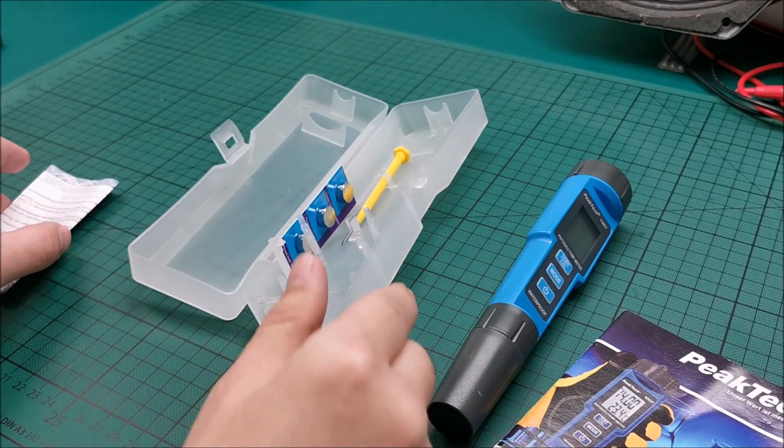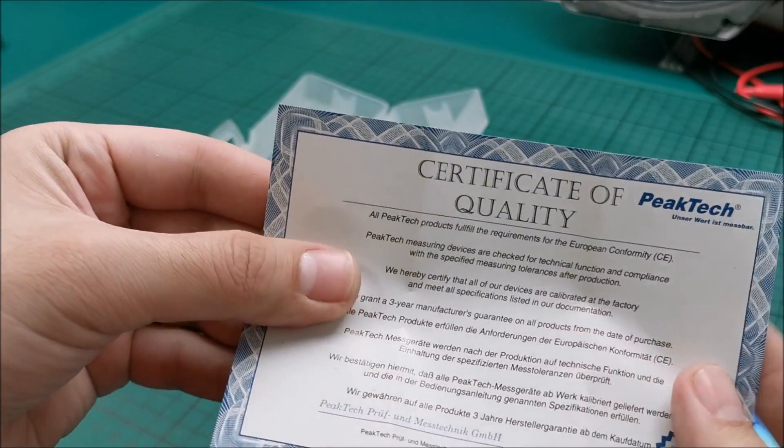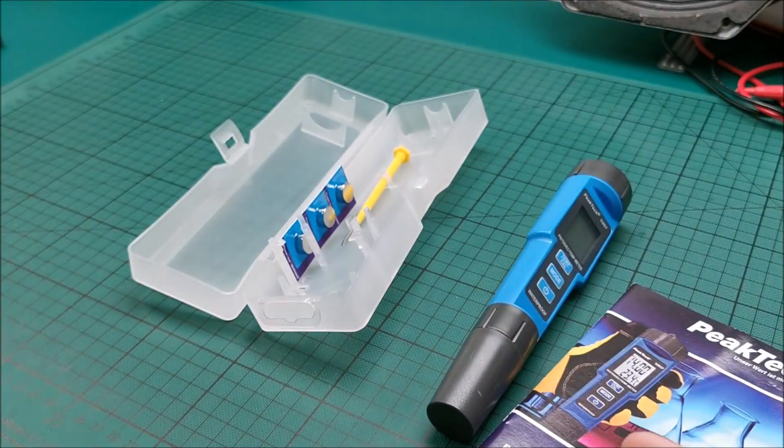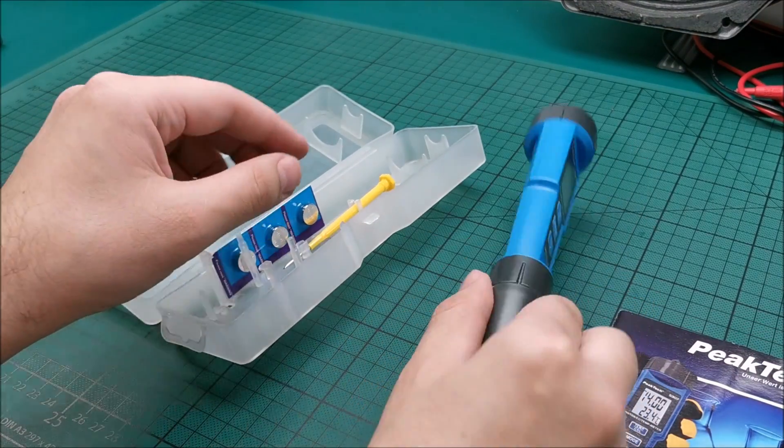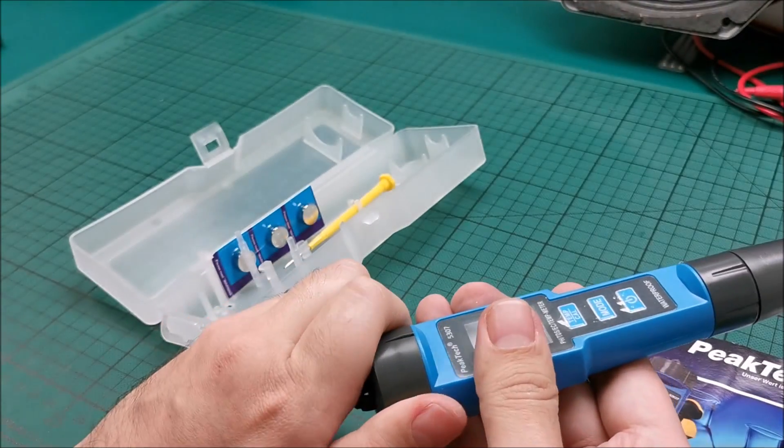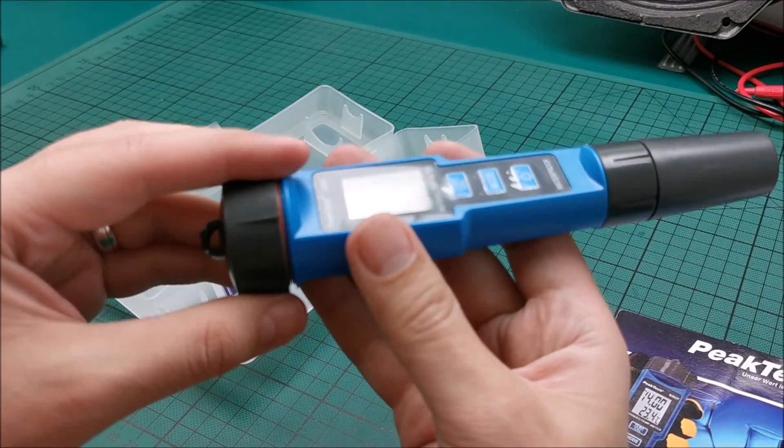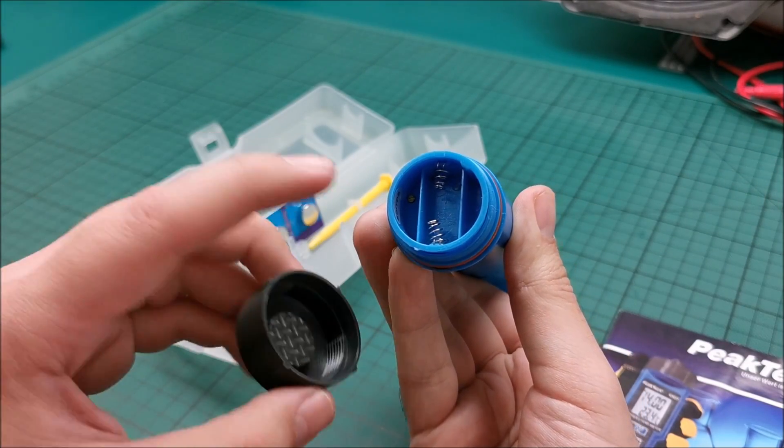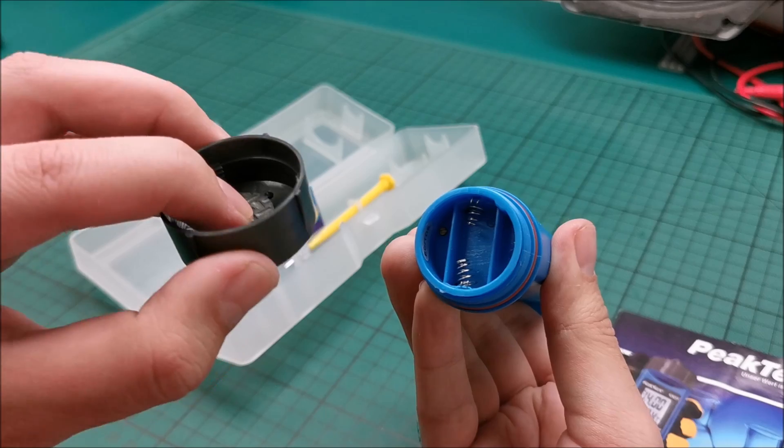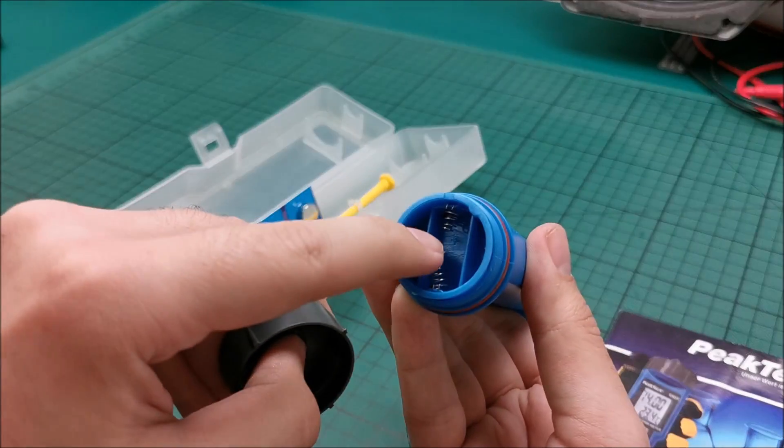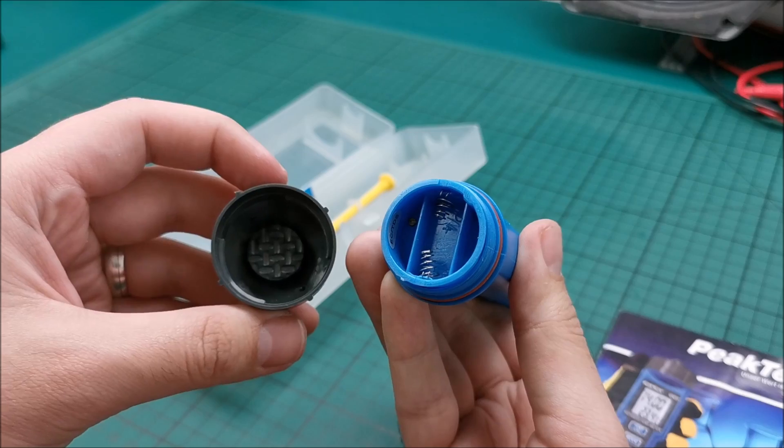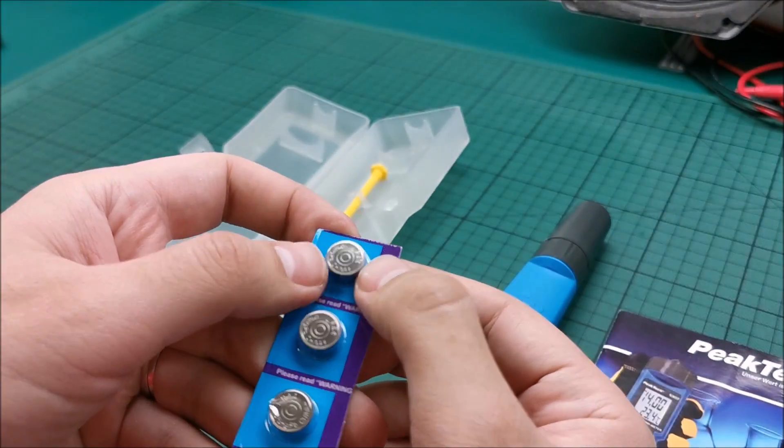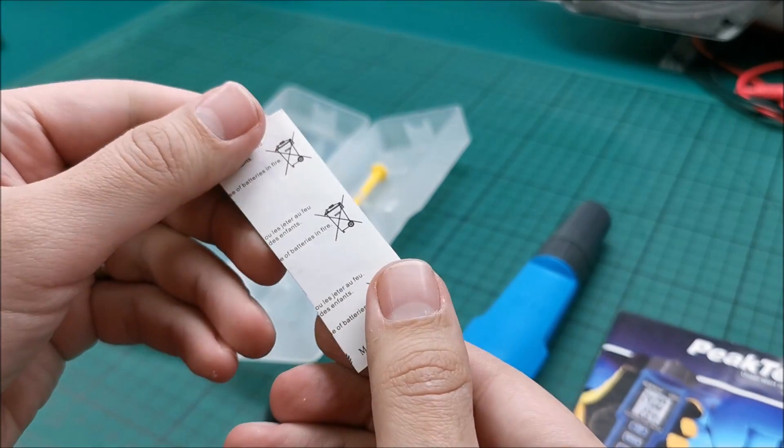Nice little box in here. Certificate of quality and manual. And I think in here we should be putting in the batteries in the standard way. I'm not reading the manual. I'm guessing first and we'll see later. So yep, here we can put in the batteries. It has a foam in here which is touching the plastic to make sure the batteries cannot pop out by themselves. And what type of batteries? LR44 batteries. Three of them are required to run this.